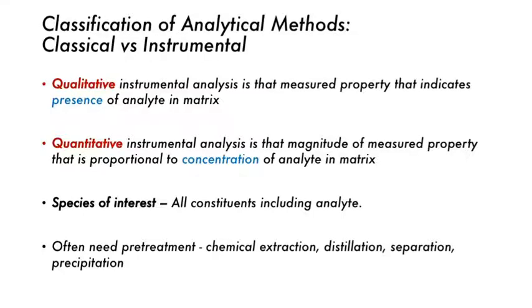It's a little bit harder to do quantitative. It's definitely possible, don't get me wrong. But it's a little bit harder than it would usually be in, for example, UV vis. So you'd only really use infrared spectroscopy for quantitative work if you had no other choice.